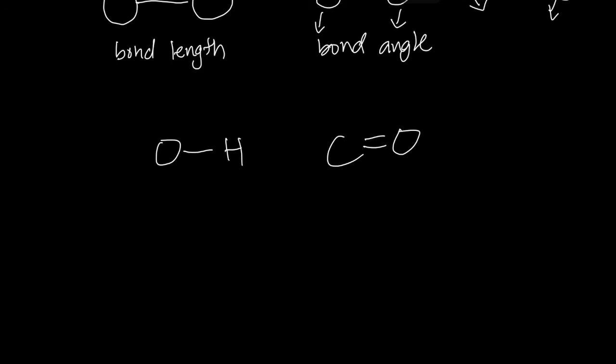They are different bonds, vibrating at different frequencies. They have dipole moments. So when we supply IR radiation to the molecule with different types of bonds, and the bonds are vibrating at different frequencies, the vibrating bonds will absorb IR radiation which has exactly the same frequency as their vibration.